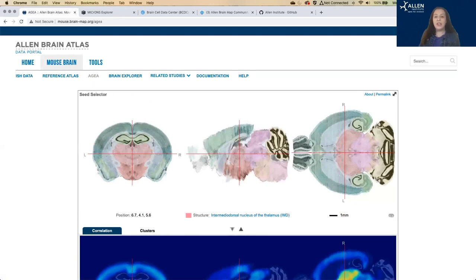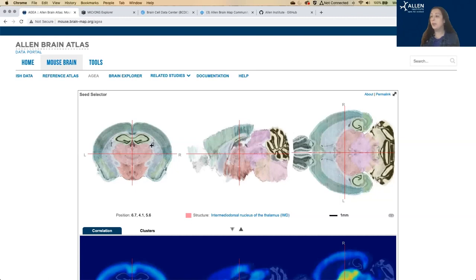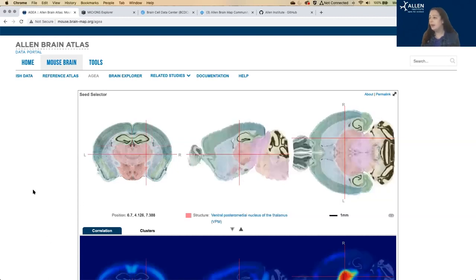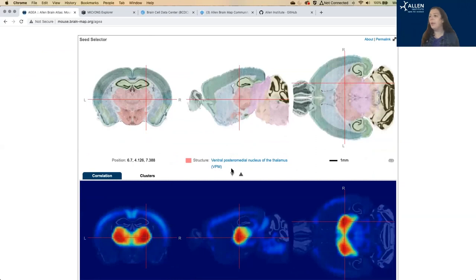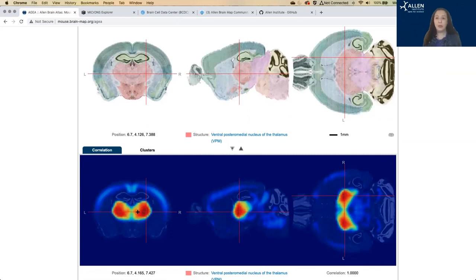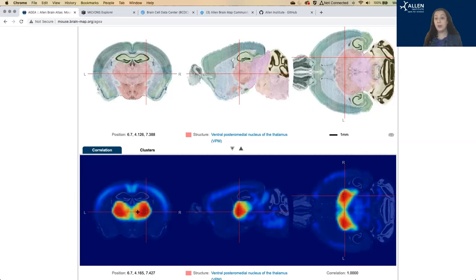So this lets you search with crosshairs to select a seed region. So I'm going to pick a random seed region. So I've got the ventral posteromedial nucleus of the thalamus. And what you're looking at down here is a heat map that shows you what other regions of the brain have gene expression patterns that are highly correlated with the region that you set that seed for.